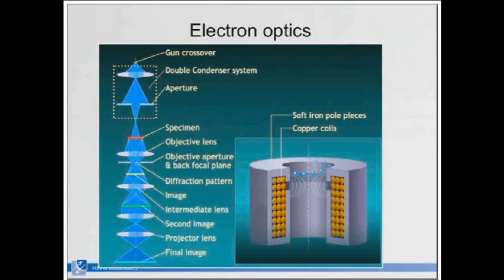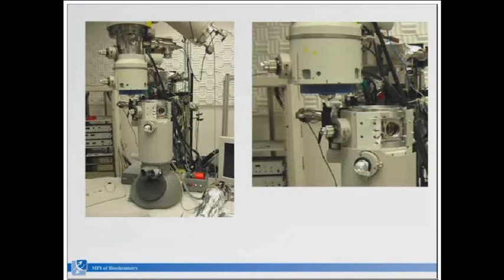That's how a lens looks. You have circular coils, and the electrons are going through these coils in circles as well. And when you, for example, align the rotation center or the stigmatism, then you will see these circles where the electrons travel through the column. So you create a magnetic field and they travel through, and this is just depicting the optical axis. This is how coils look in real nature.